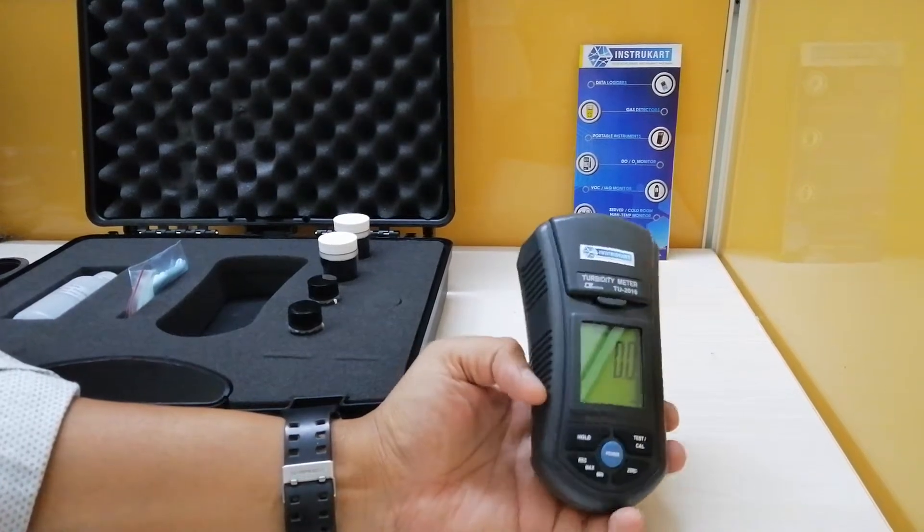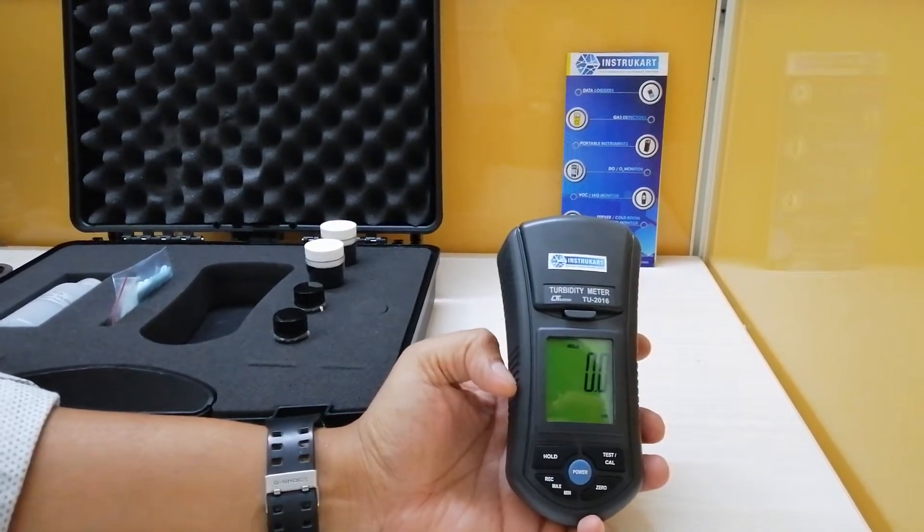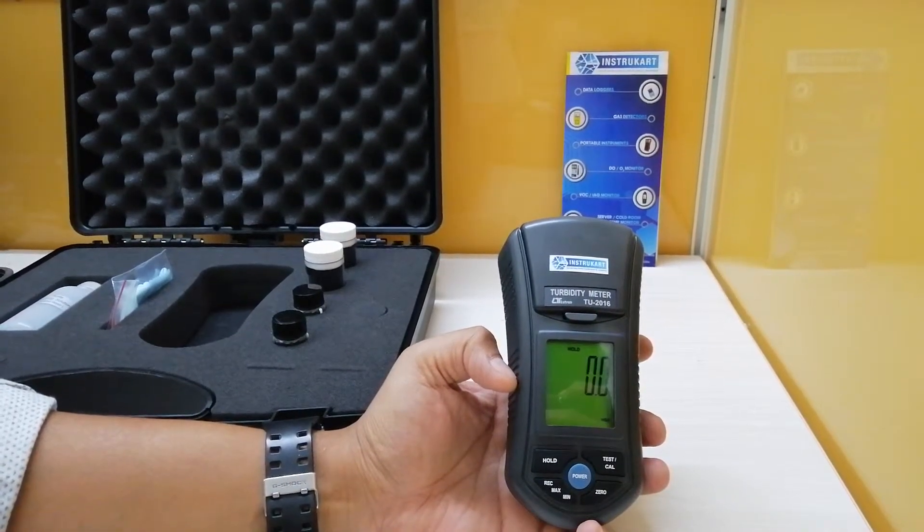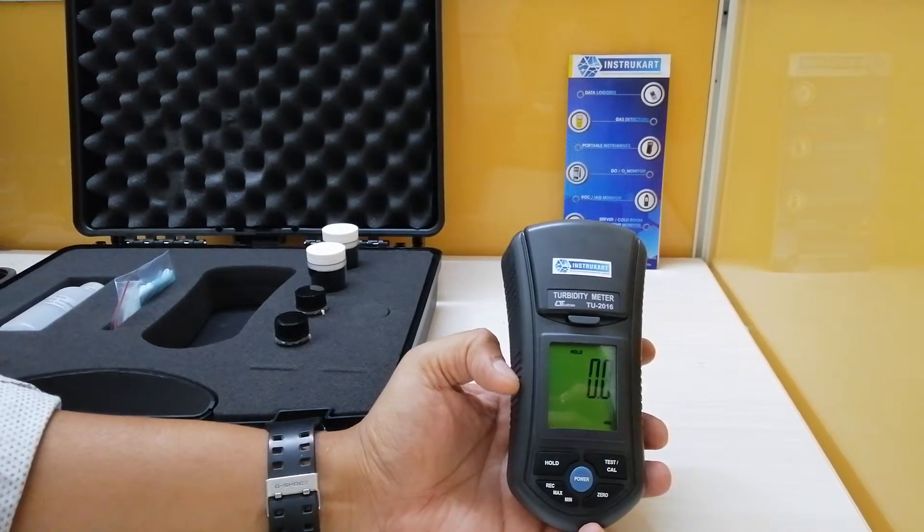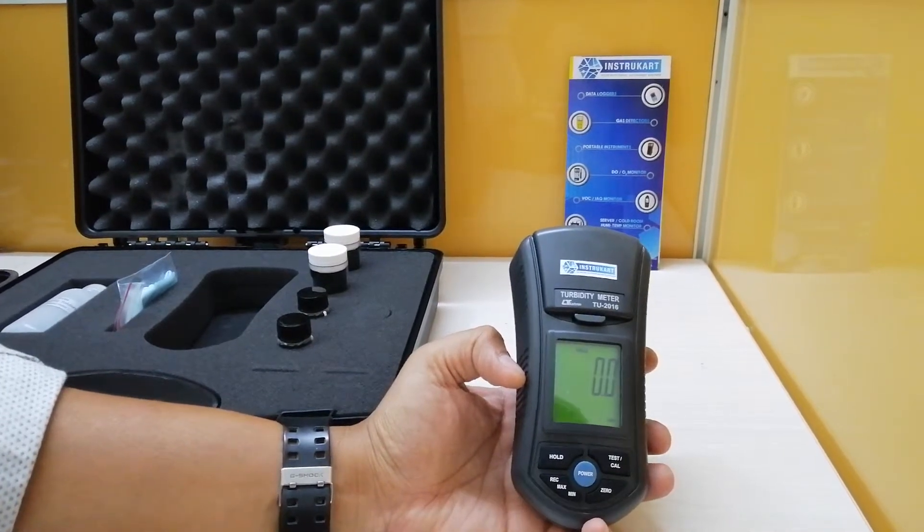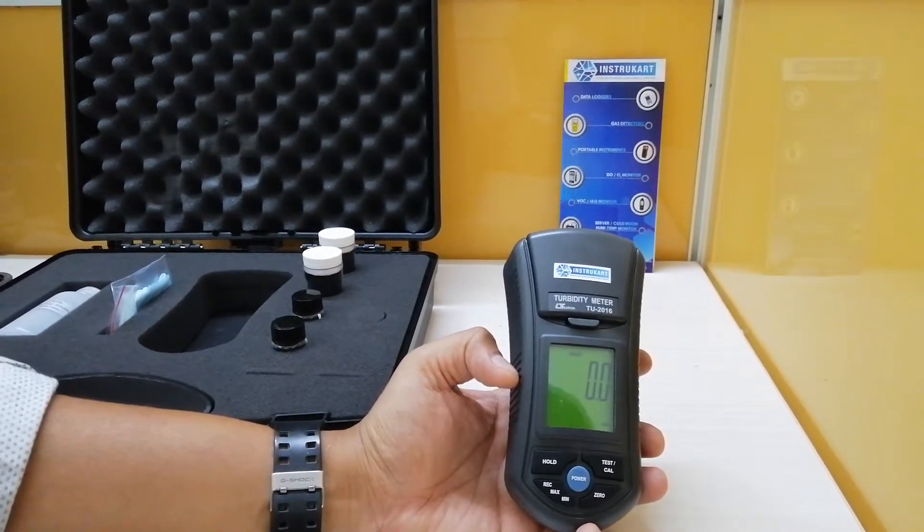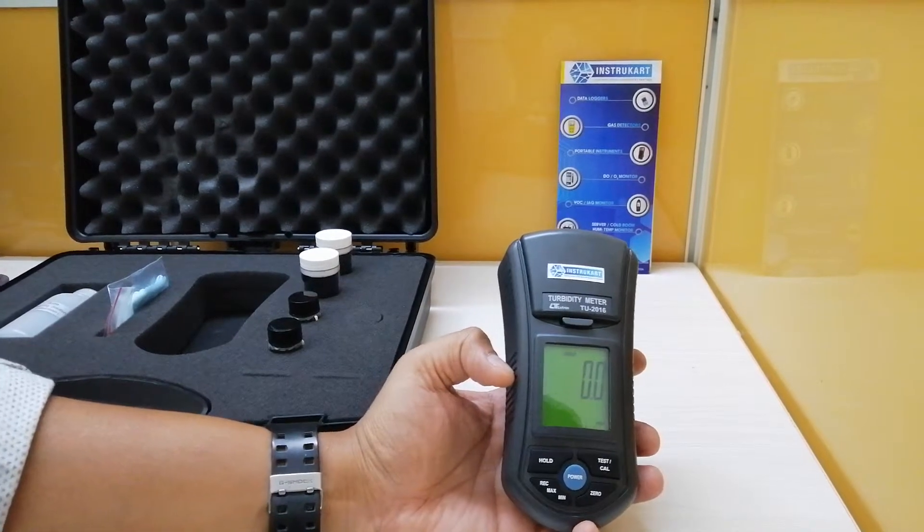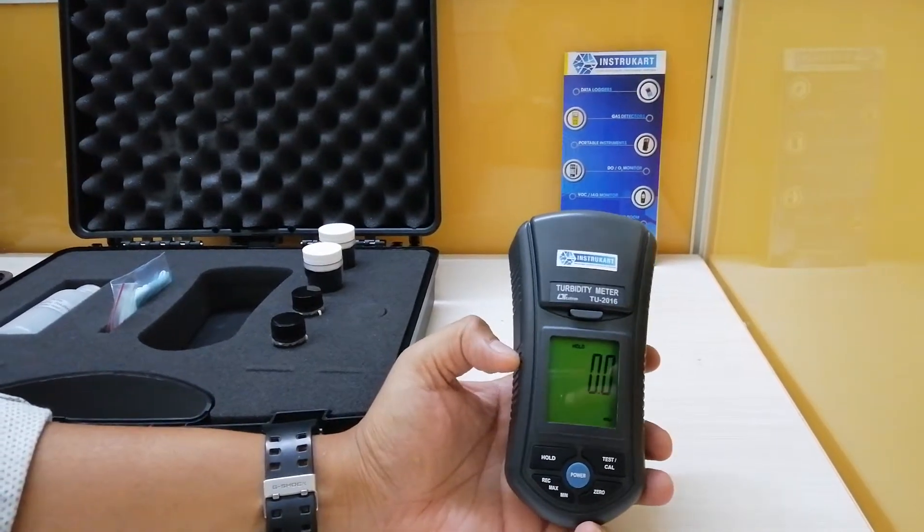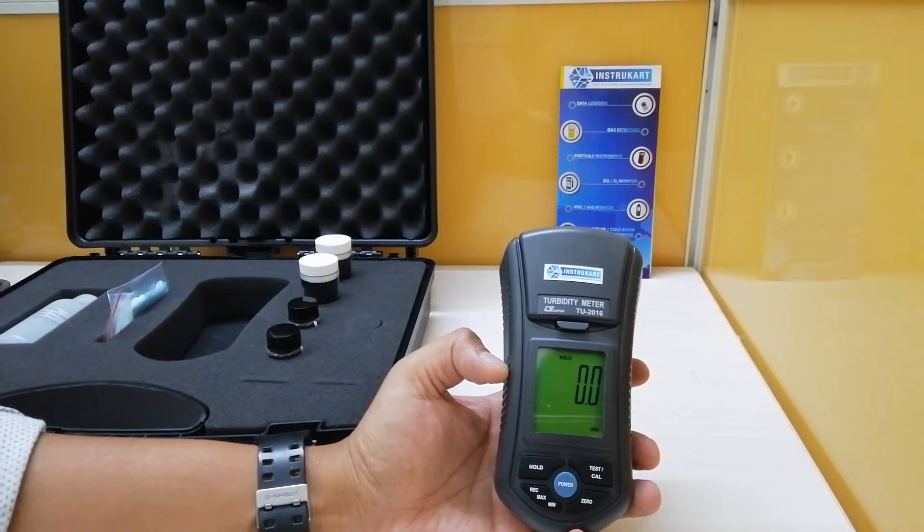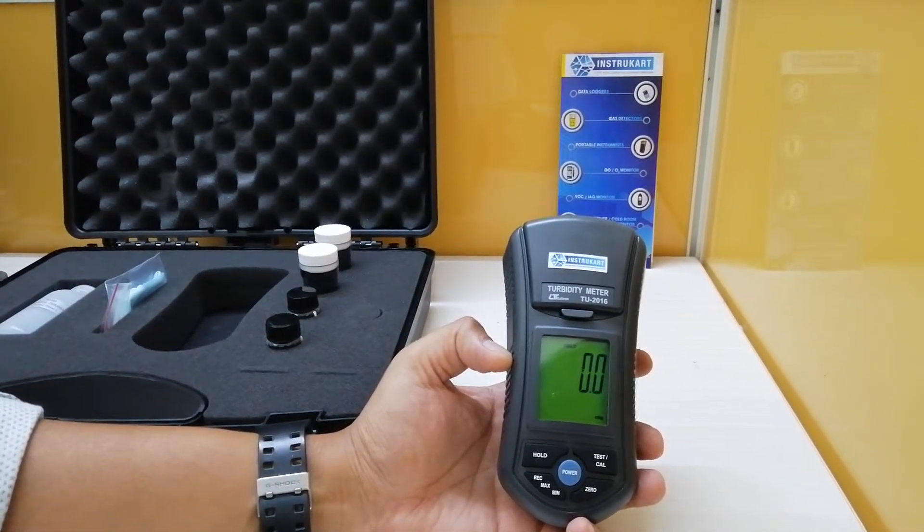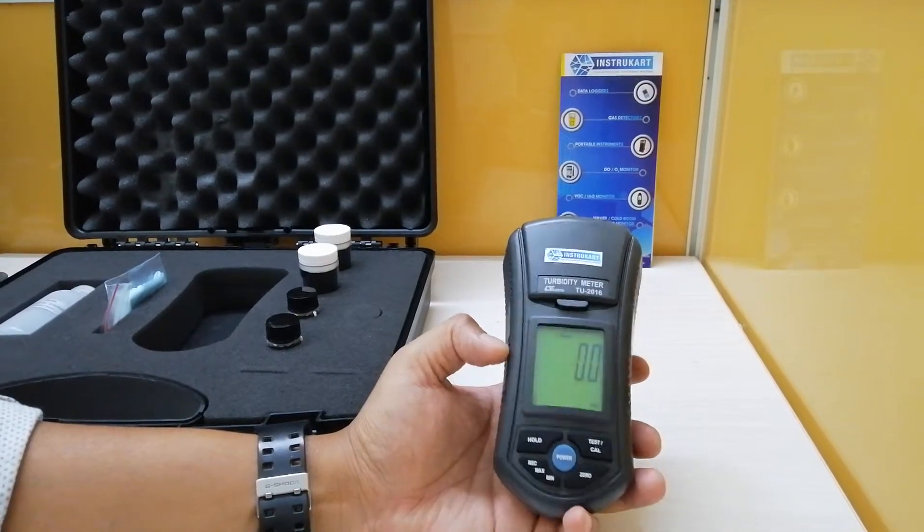This particular meter has got a custom one chip microprocessor LSI circuit and it has got a range of 0.00 to 50.00 NTU which is also 50 to 1000 NTU. NTU stands for nephelometric turbidity unit. For other specifications, it has got an accuracy of 0.00 to 49.99 NTU with a resolution of 0.01 and plus or minus 5 percentage reading.